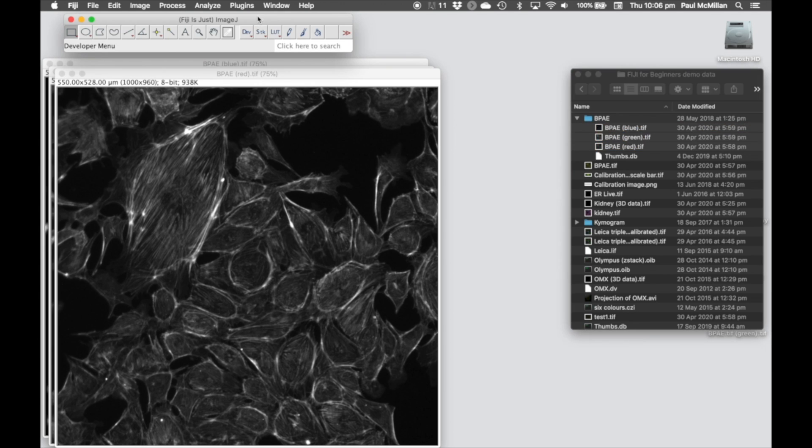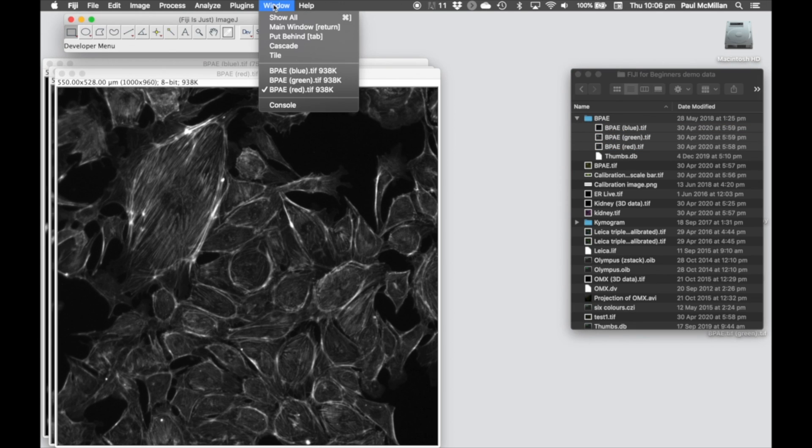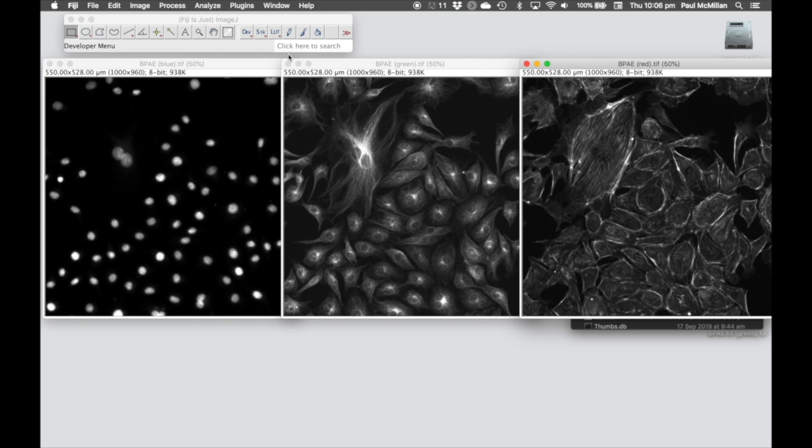They're sitting on top of each other, so let's go to Window Tile, just to make that a bit easier for us to visualize.